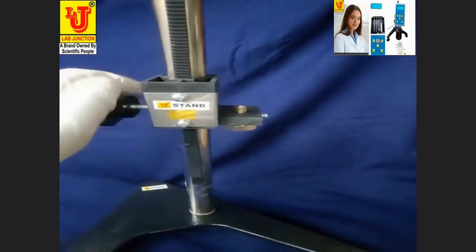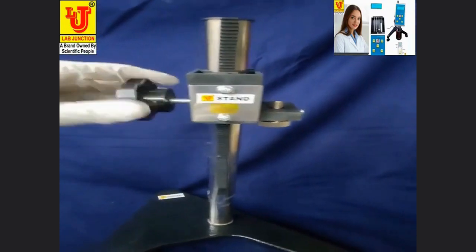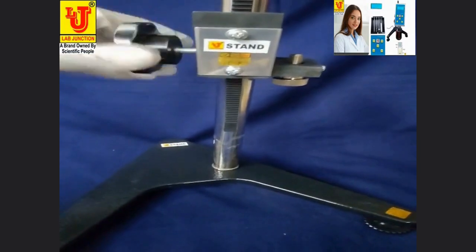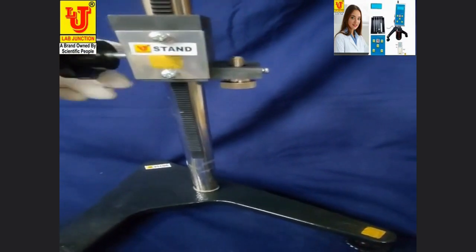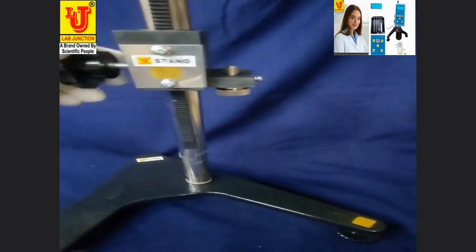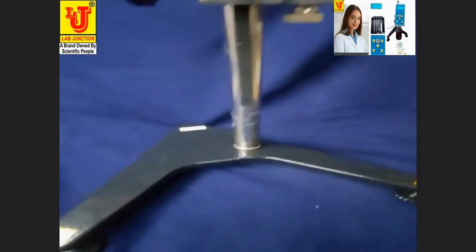Now this is movable, up and down. Fix your location as you desire, as per your sample picker.